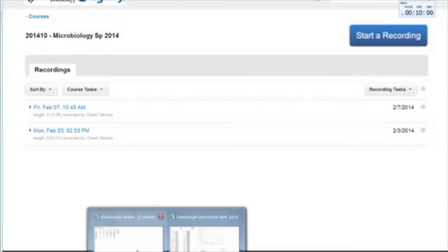Everybody, I am going to give you some quick instruction that will really help you do the Excel portion of your next lab report. Okay, here we have some make-believe data. Notice, not a real experiment. So these aren't real times. These aren't real dilutions. So what I want to show you is how to work with the data that you do have in order to get the best and quickest, most easy results.